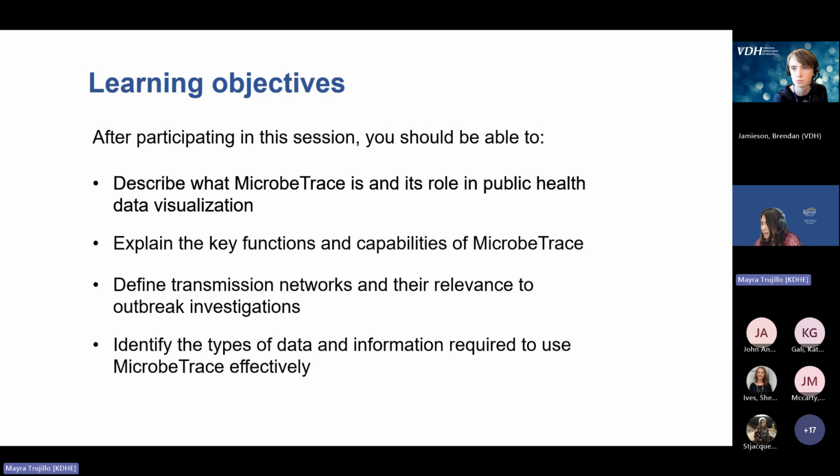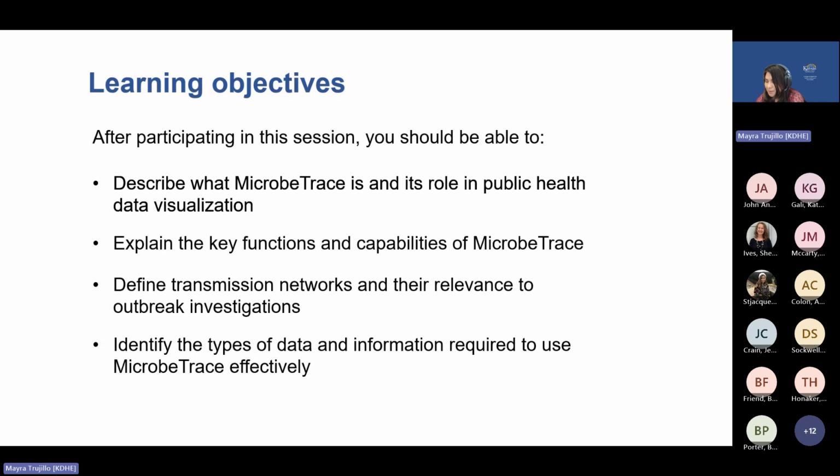So before we dive in, I'd like to review the learning objectives for today's lesson so you know what to expect and what you should be able to take away by the end of this presentation. After participating in the session, you should be able to describe what MicrobeTrace is, its role in public health data visualization, explain the key functions and capabilities of MicrobeTrace, define transmission networks and their relevance to outbreak investigations, and lastly, identify the types of data and information required to use MicrobeTrace effectively.